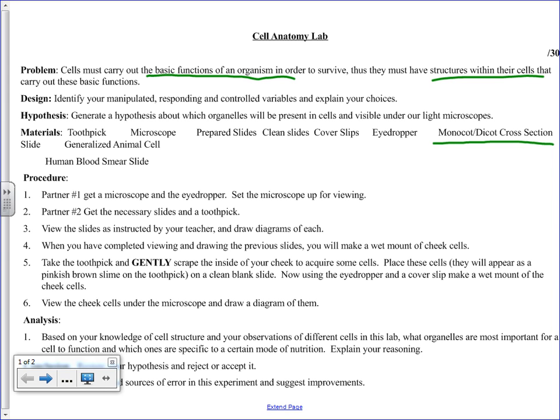You will see that the chloroplasts and the nucleus tend to be pushed against the outside of the cell, and the cell looks kind of blank in the middle because of the water vacuole. You've got to use your imagination a little bit. I'm not saying make stuff up, but you do have to look at it and go, well, that could probably be this. If you think it is, then label it that way. You're probably right. But at the same time, if you think it's a ribosome, you're wrong.